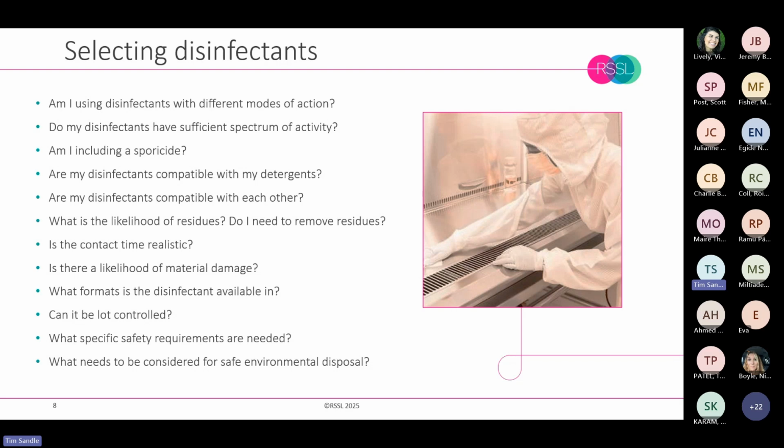And we also need to ensure that the vendor we're purchasing from is suitable. So can our disinfectant be at least lot controlled? What are the safety requirements? Again, if we're going to introduce a disinfectant with a particular pungent smell, how are operators going to react to that? And do we have any specific PPE requirements? So will we require operators to wear respirators, for example? And also we need to consider how we can safely dispose of the disinfectant after use and meet environmental legislation, because we don't want to be fined by the Environment Agency for pouring tons and tons of unauthorized chemicals into the public drainage system, as an example.